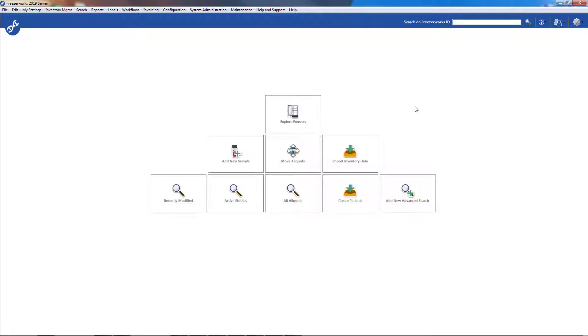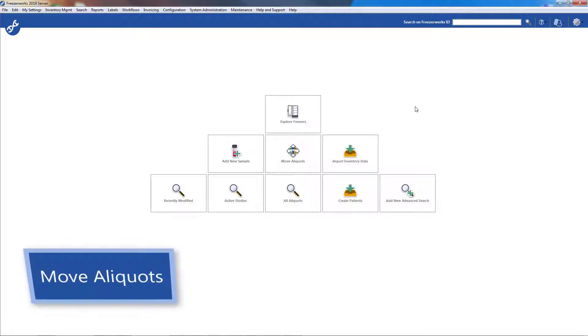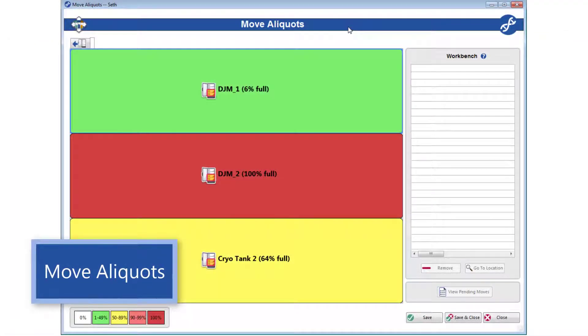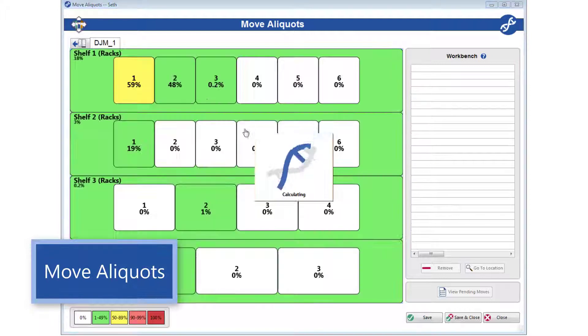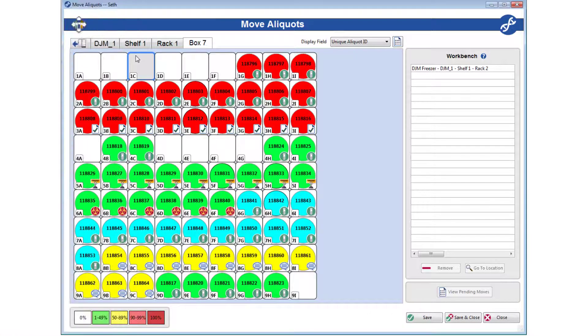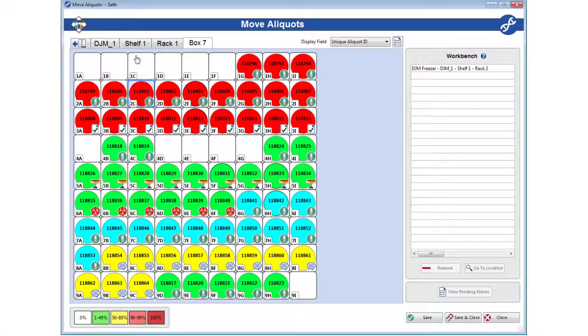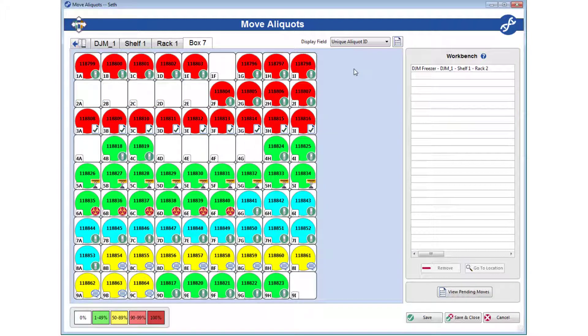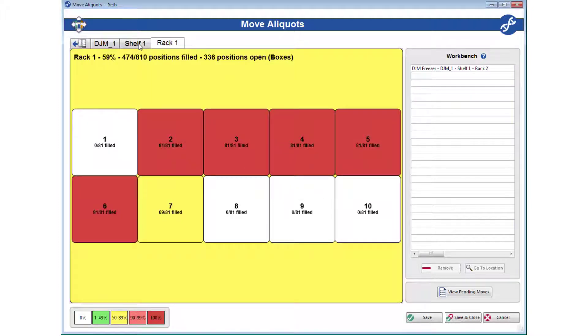Today we continue our series on visual freezers with a look at the new and improved Move Aliquots tool. From day-to-day freezer operation to the oh my lord my freezer is failing crises, quickly relocating entire freezer subdivisions, changing the positions of individual aliquots, and consolidating freezer space are all very common tasks in the sample management realm. Our updated Move Aliquots tool allows you to do all of this with an intuitive visual interface.